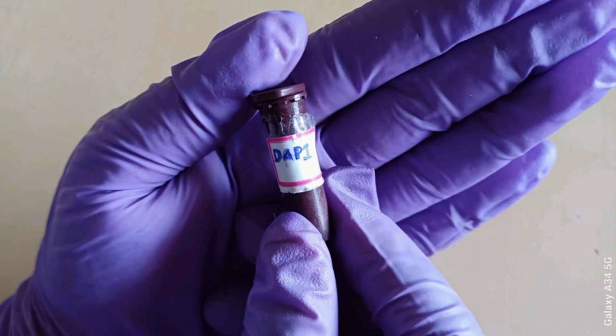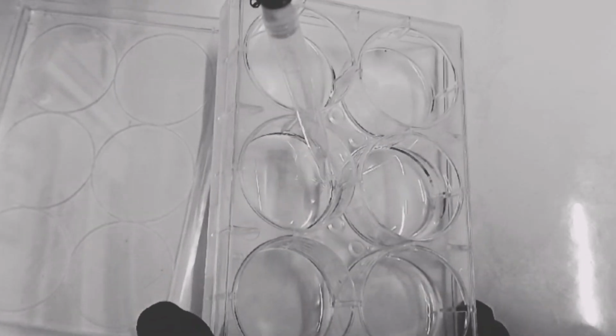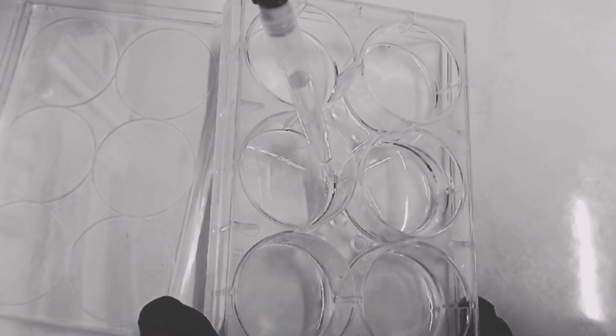After incubation with the secondary antibody, the cells are washed again with PBST, and at the same time we can also counterstain the cells with DAPI, which is a nuclear stain. After incubating the cells with DAPI for about 5 minutes, it is removed and the cells are again washed with PBST, and the cells are air dried and the cover slip is slowly removed from the Petri plate, and it is now ready for mounting onto the slides.